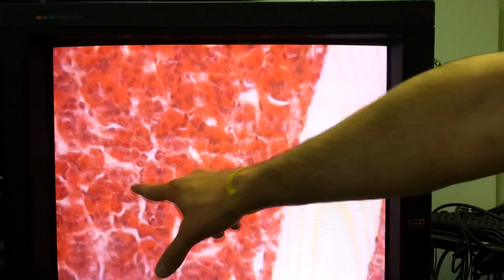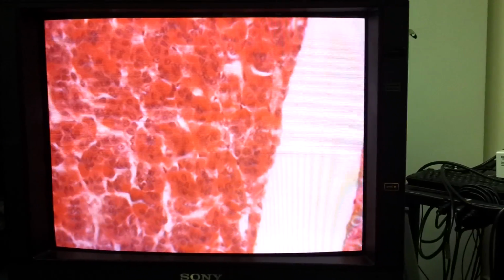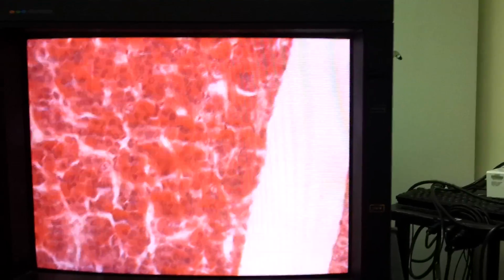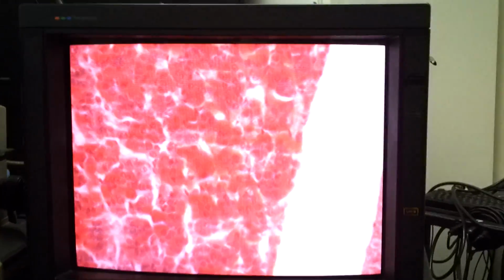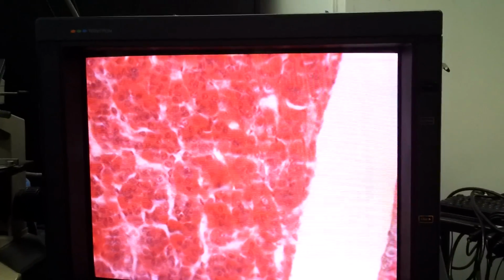Usually what I do is I make up the questions in advance, but that's really just making up half the question, because the other half is when I ask you what the cell type is, what it makes, and what it's a target for: what am I pointing to? So the answers will depend on what the pointer is pointing at. What I usually do is put these in the microscope and see what jumps out at me as a very clear example.